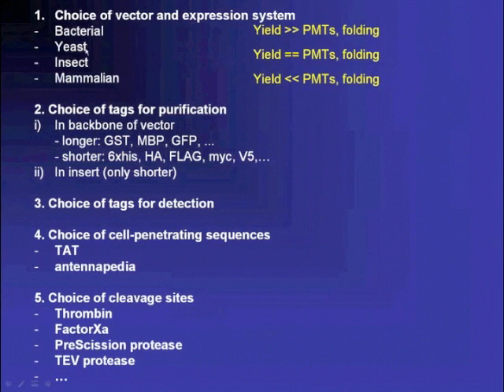I know people who worked with yeast cells, and you might still get good amounts and get the post-translational modifications and fold it. Okay, it's always an isolated domain. How much does it relate to the real-time, full-length folding? One never knows, but one could consider that. And I want to raise that if one goes to the Gateway system, I think it's perfectly doable. Sorry, what's the Gateway system?